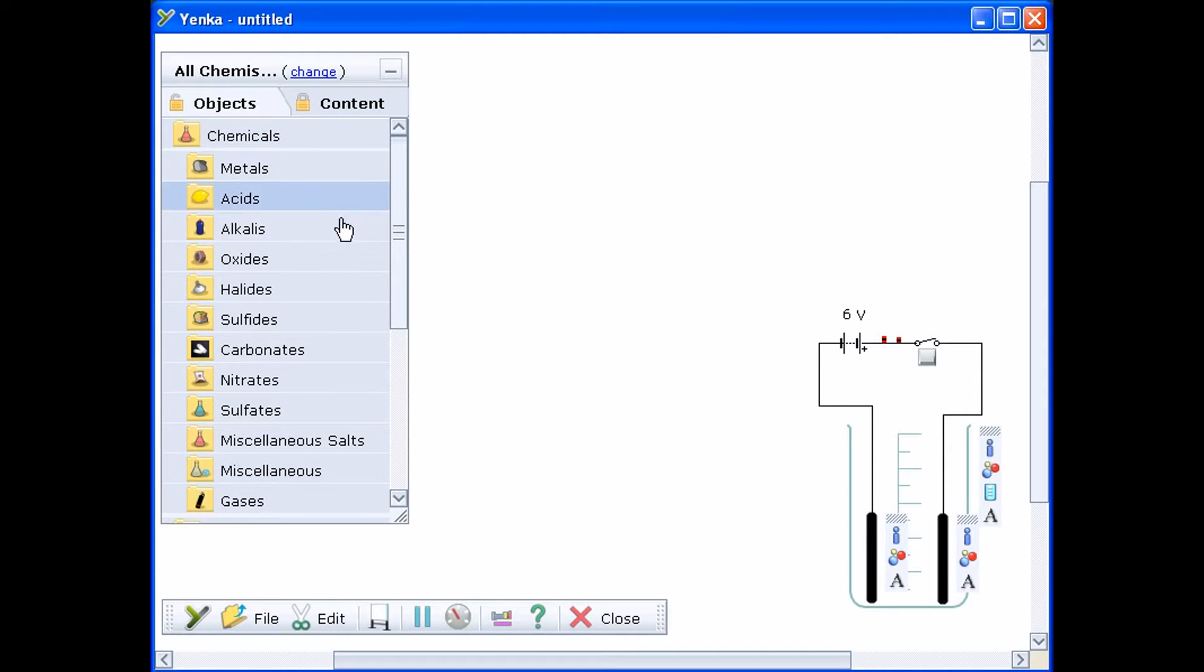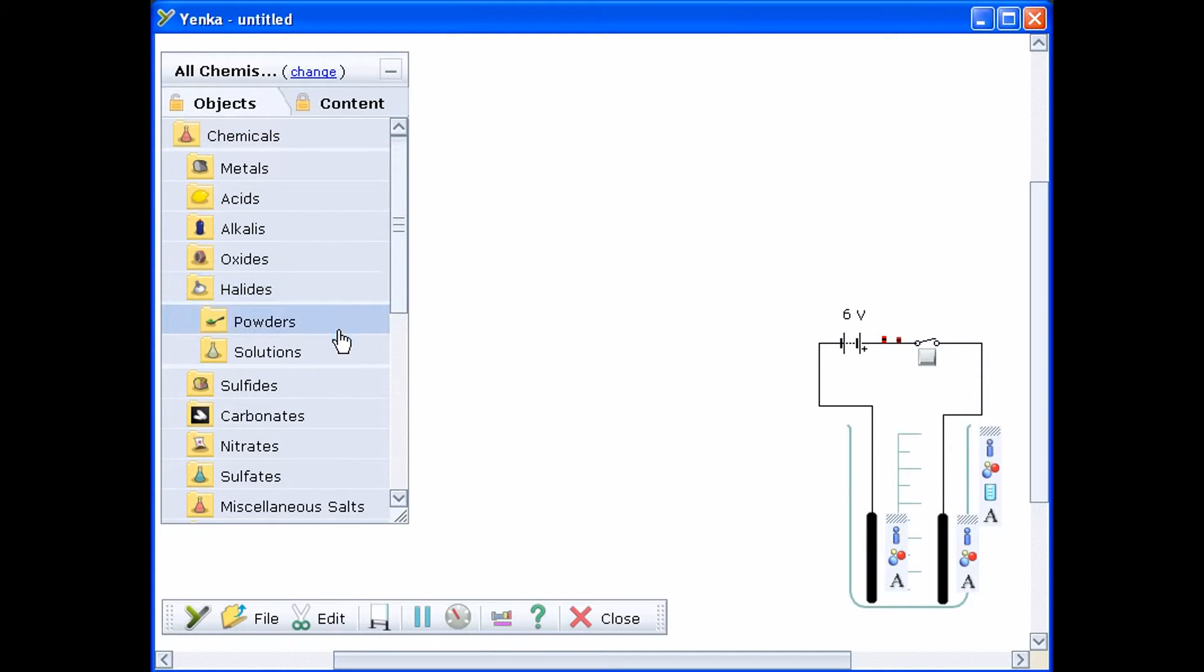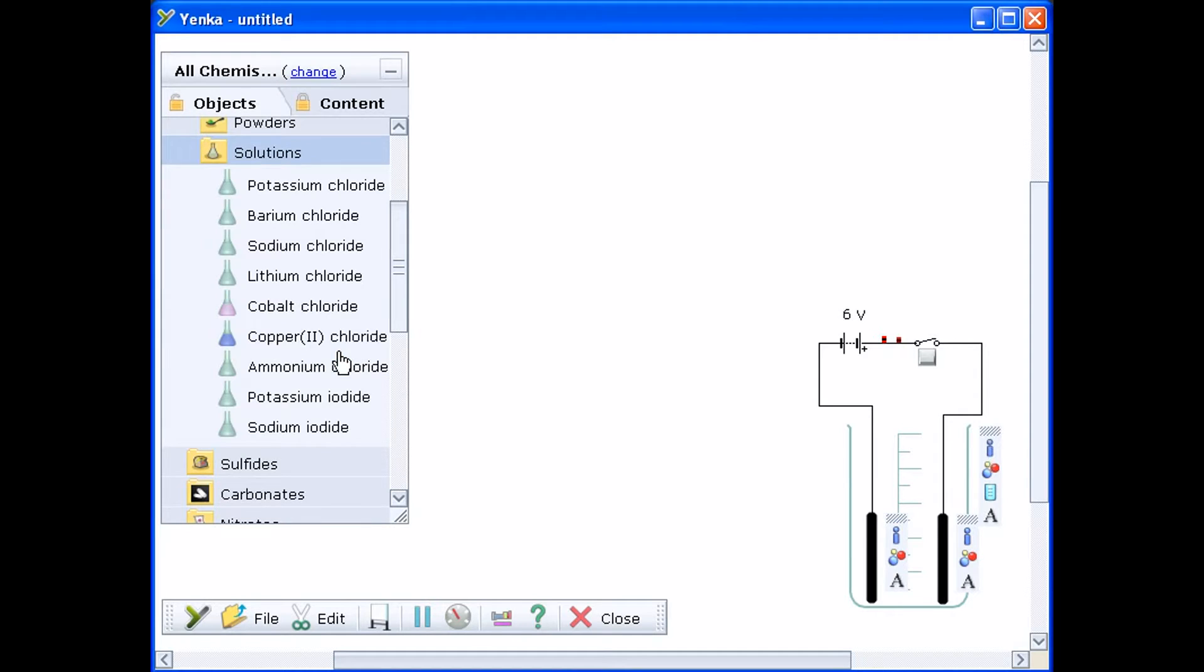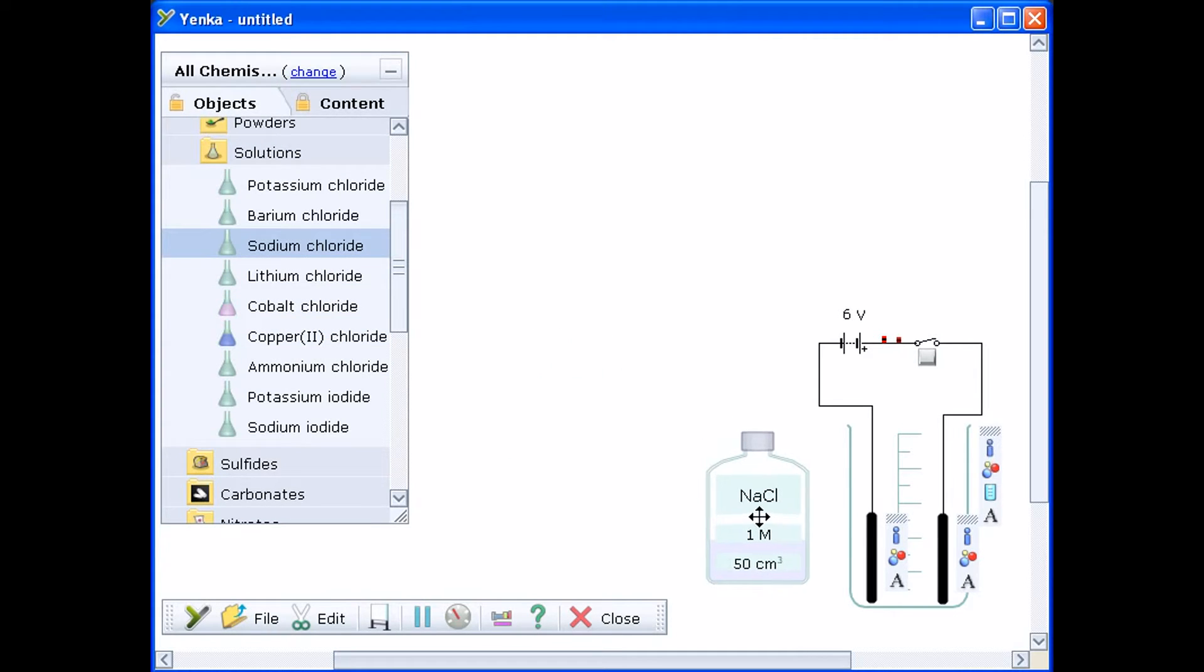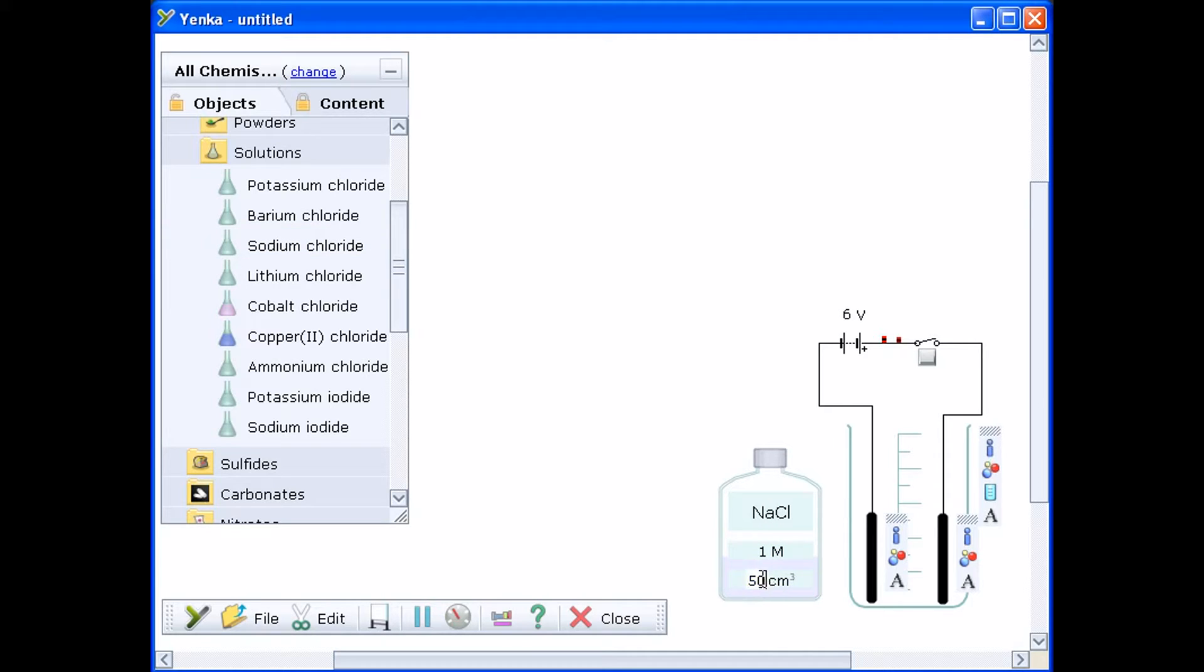Now add the electrolyte. Here we'll use sodium chloride solution from the halides folder. Add it just as you would any other chemical. Drag it over the beaker and release the mouse button when you see a pouring cursor.